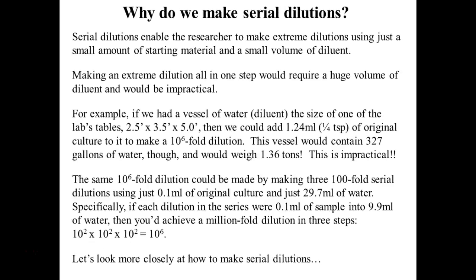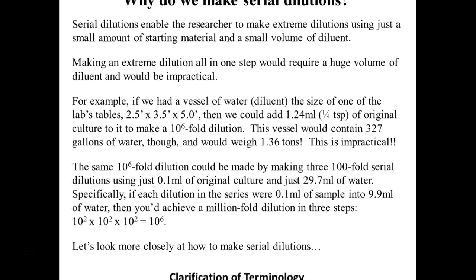So, why do we do serial dilutions? It wouldn't be practical to take that original tube and put it on a microscope slide and count each individual cell. Depending on the volume you're dealing with, it would just be too much. If we dilute in series, we dilute as we do each step, and we can reach higher dilutions faster than, say, putting 1 ml into 1,000 milliliters of water. That was the part that I didn't draw out on the board.